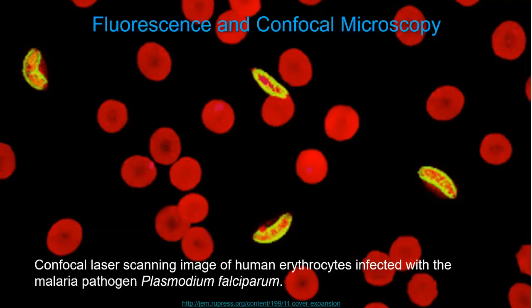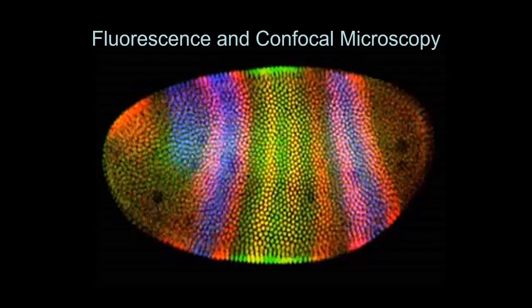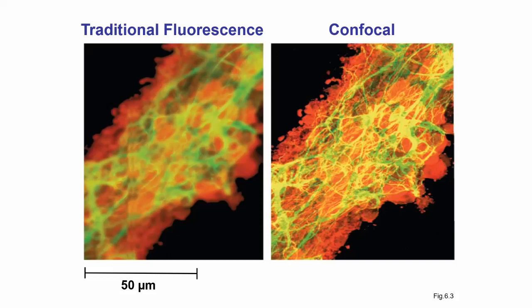Fluorescence is starting to get used a lot more in the medical industry. Microscopes are a lot more expensive, but you can diagnose very quickly. So here's a stain that's looking for Plasmodium, which is the organism that causes malaria, and it pops out very easy to see what's in there. I saw this one on the internet and thought it was kind of cool. Somebody, I don't know what they're doing, made some sort of rainbow cell, but very nice to look at.